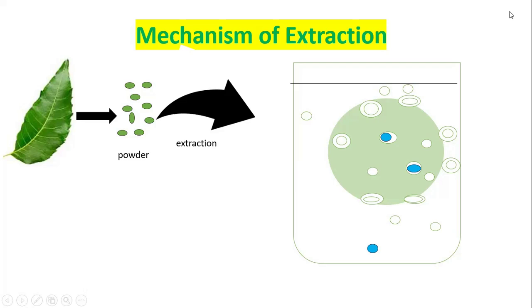The liquid droplet enters again, as I show you here, and causes the dissolution of the active chemical component, and this dissolved component comes outside. Now this is the third one. A water droplet comes here and passes through this. Now just see here.